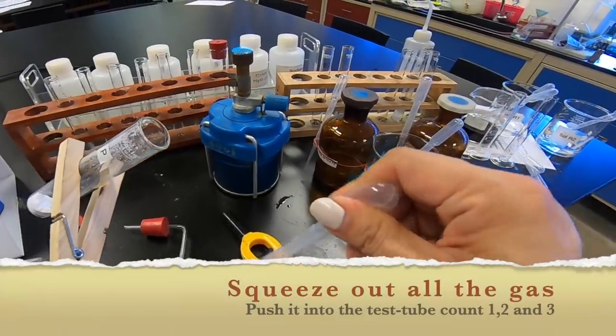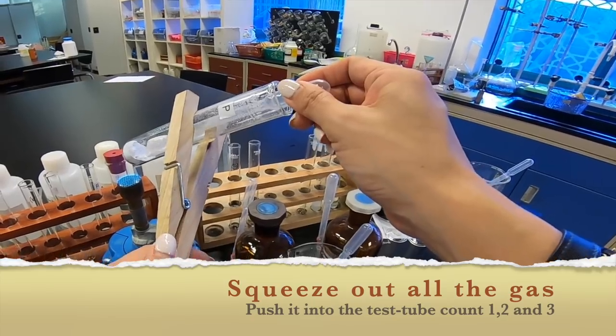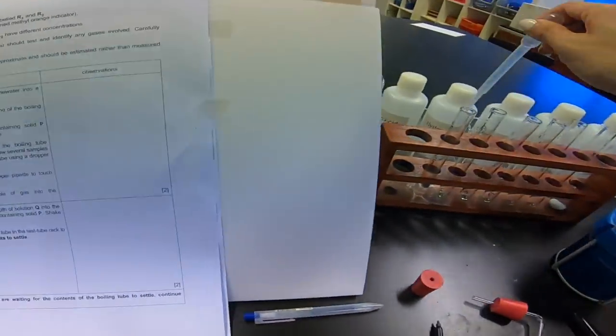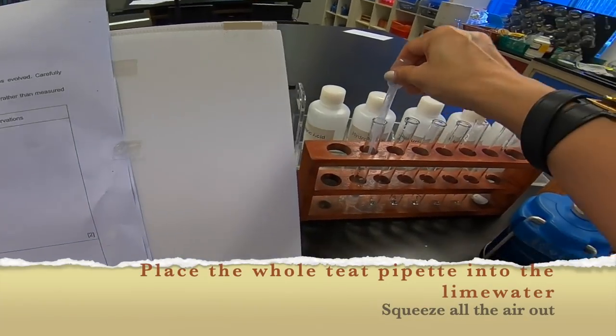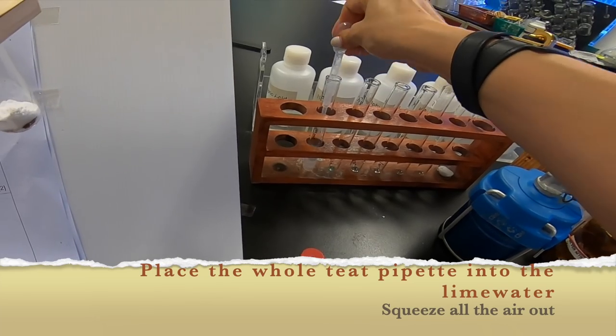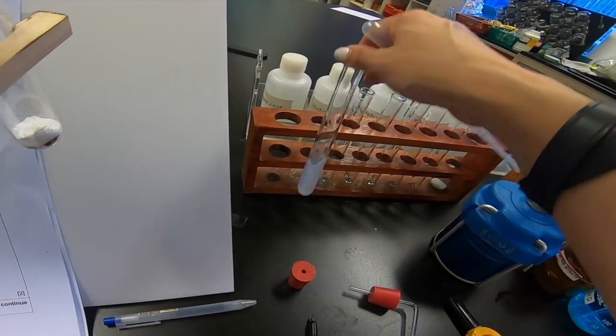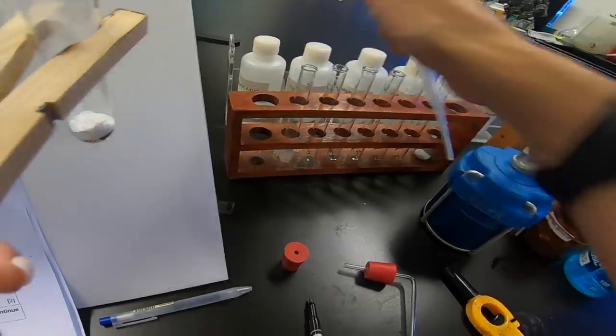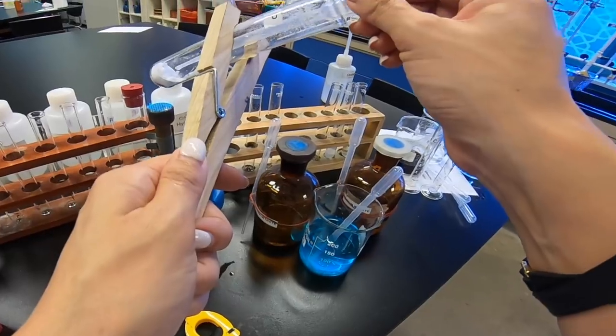Now, this is the teat pipette. Squeeze out all the gas. And then, as you heat, bring this inside. We count 1,000, 2,000, 3,000. Take it out. Put it right inside our lime water. This thing must go through the lime water and bubble through it. I already see a slight... Can you see that it's already turned?